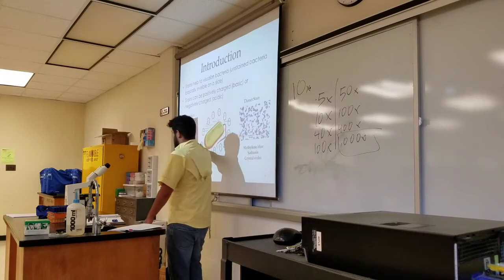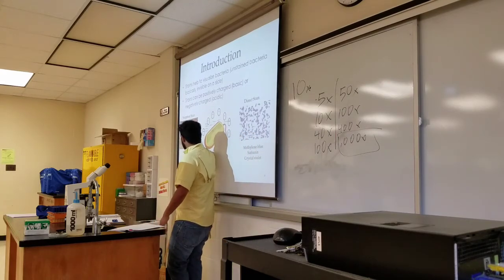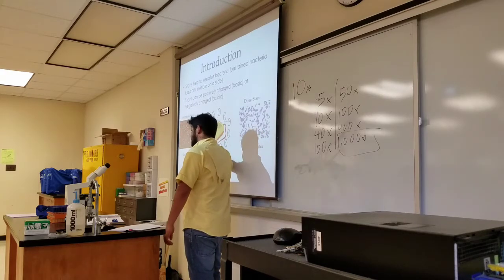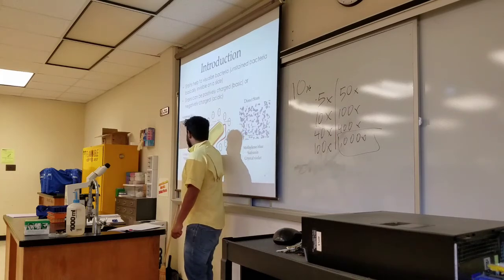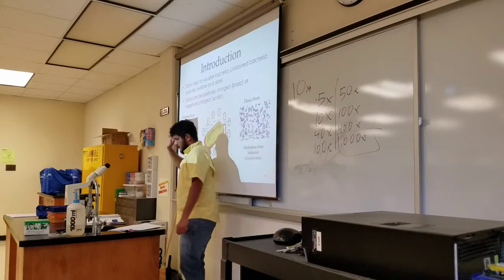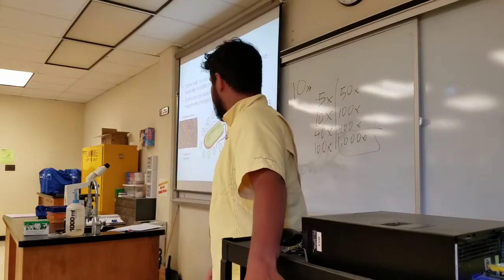The negative stains, because they're partially negatively charged, will tend to repel from our bacterial cell wall, which is also partially negatively charged. In a negative staining, what we try to stain is the background, and then what we have clear is the bacteria itself.